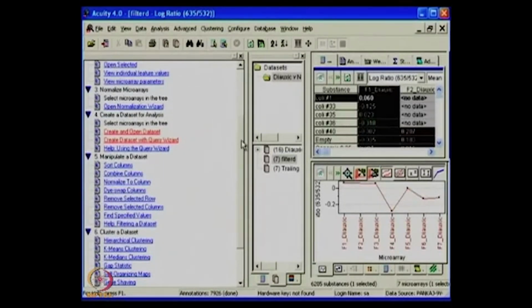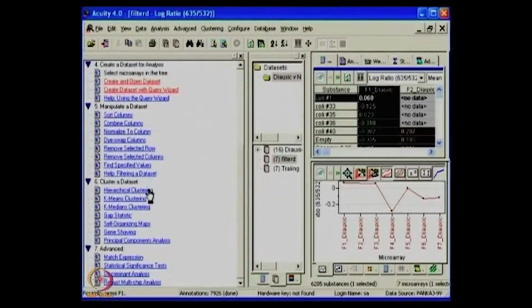Then once you have done that, you can go and do clustering, which is a visualization method. Technically the clustering is divided into 2 types, hierarchical and non-hierarchical. Hierarchical means that in the starting you have only one start point and then all other features are attached to it. The other one is the non-hierarchical type, where each group behaves independently of each other.